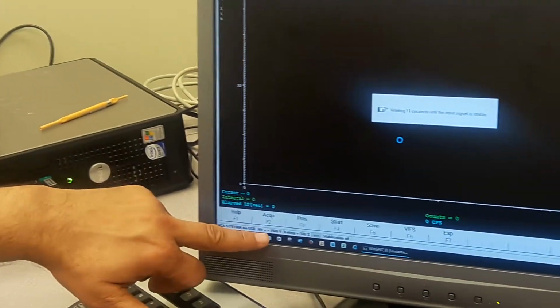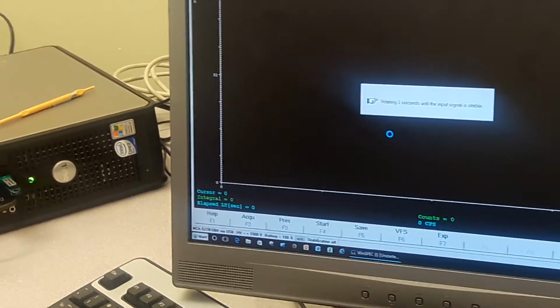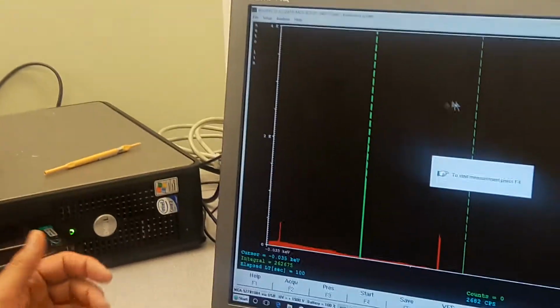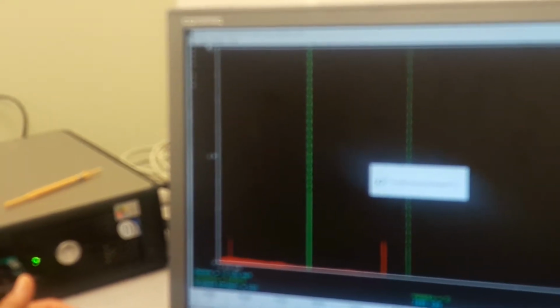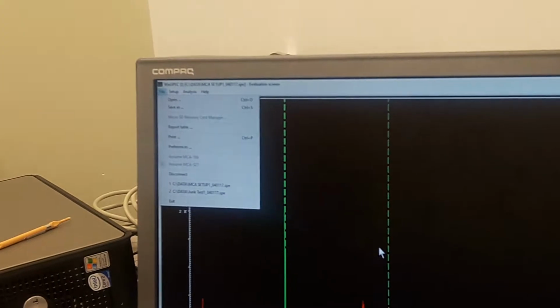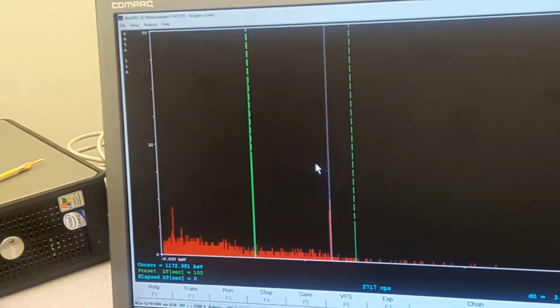Till we get all the readings, and you can see them in here. MCA 1084, high voltage is set at 1500 volts, battery 100%, stabilization is off. We are almost there now. As we load up the high voltage, give it a few seconds, it will bring up the setup spectrum that I had from my previous setup. What I can do is simply go to setup, leave the high voltage as is, simply disconnect this MCA from here. And if you want to make sure that you are actually acquiring, you can start a quick acquisition to make sure that you're getting real data. Yes, I'm getting real data.